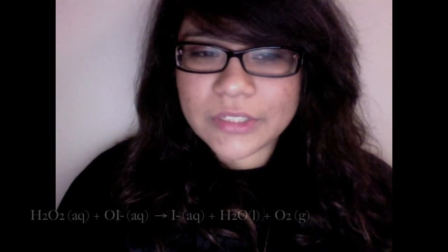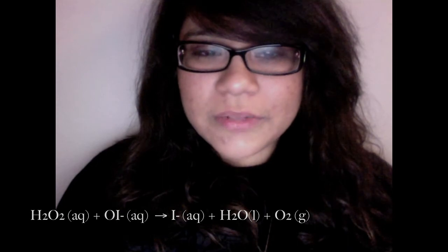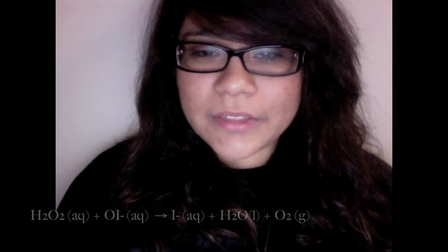The hydrogen peroxide and the iodide solution cause a decomposition reaction. The dishwashing detergent provided a place for the oxygen gas to go after the reaction had taken place. The water and the gas with the dishwashing detergent turned into foam and propelled out of the container. We ended up with a large amount of foam that sort of looked like a toothpaste an elephant might use.